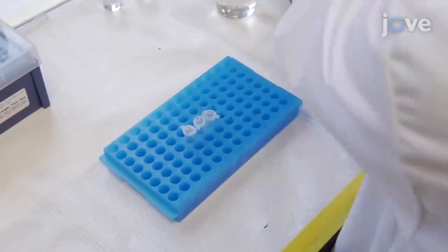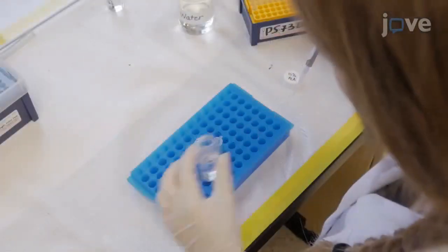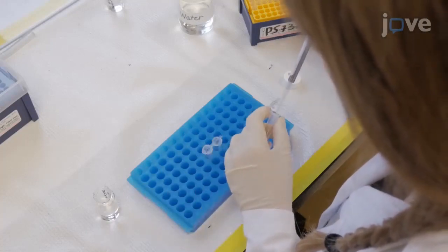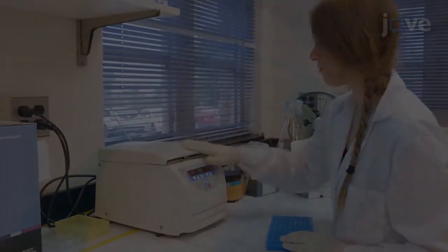Aliquot 100 microliters of each sample slurry to a new tube, then add 25 microliters of 25% perchloric acid for vortexing and centrifugation.